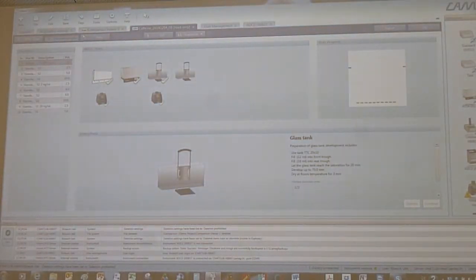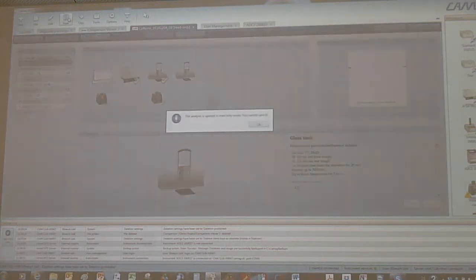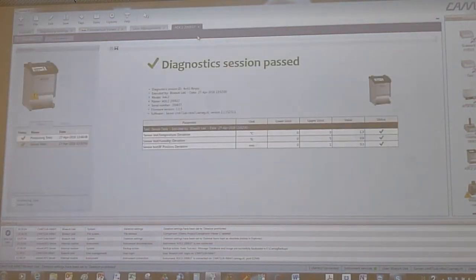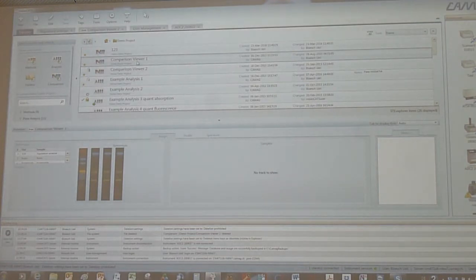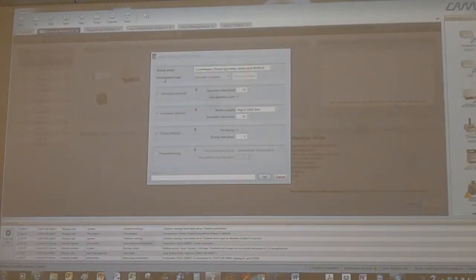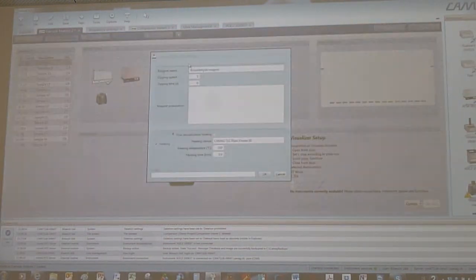And now, at the time of saving, okay, now here. So I change here. Okay, and I change here a little bit.